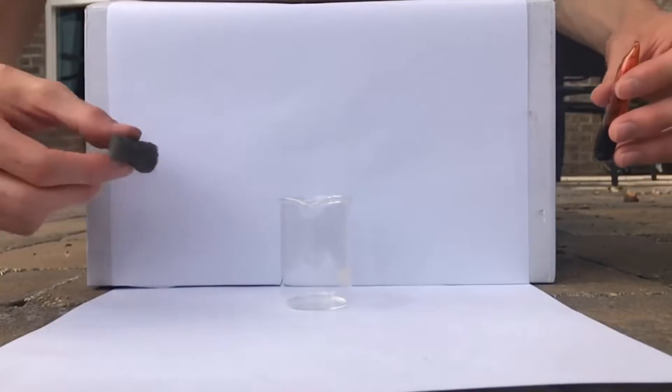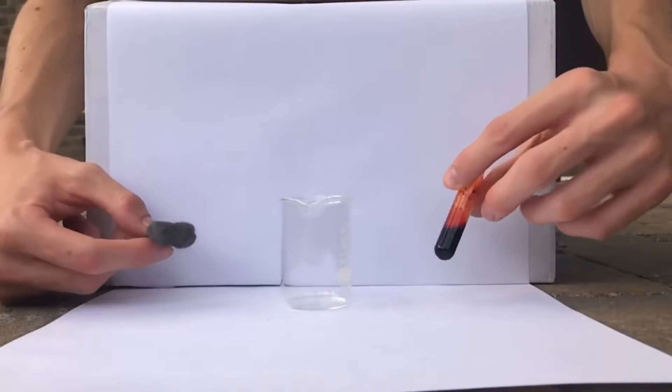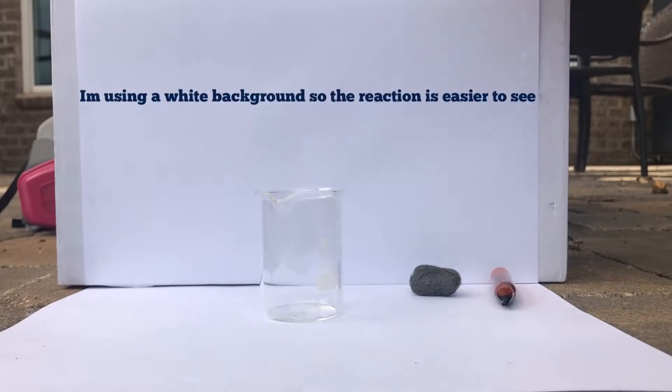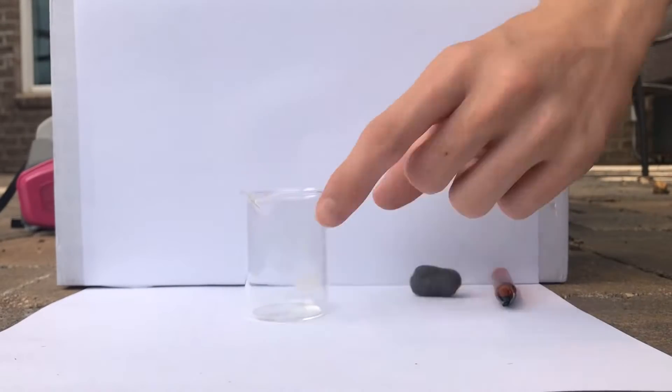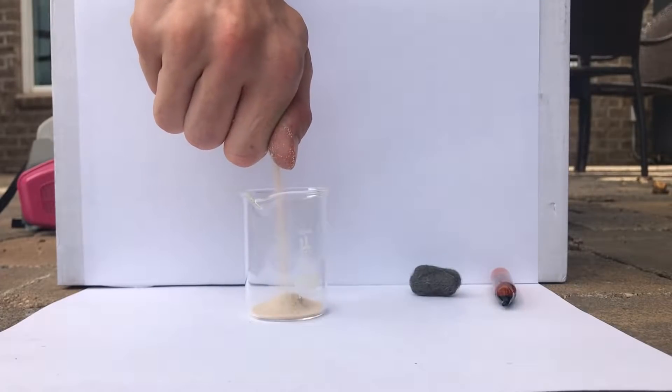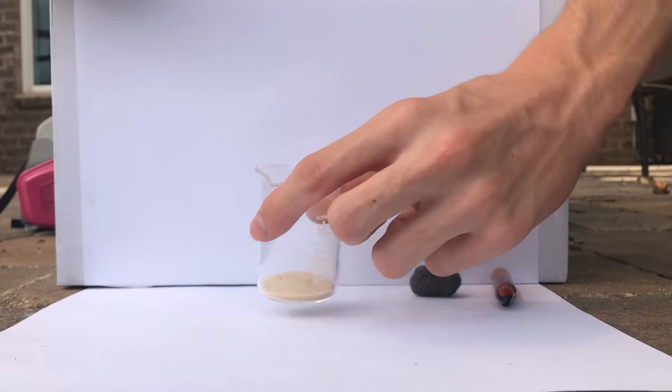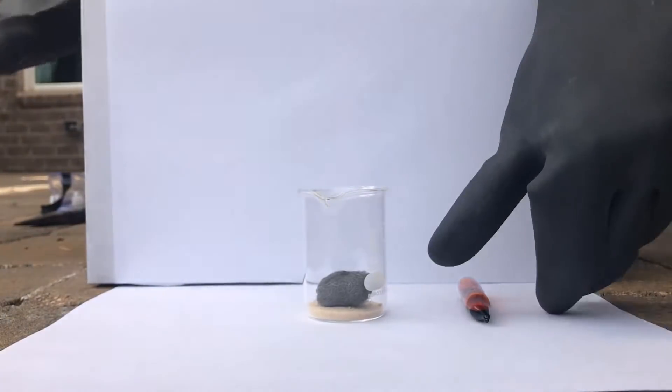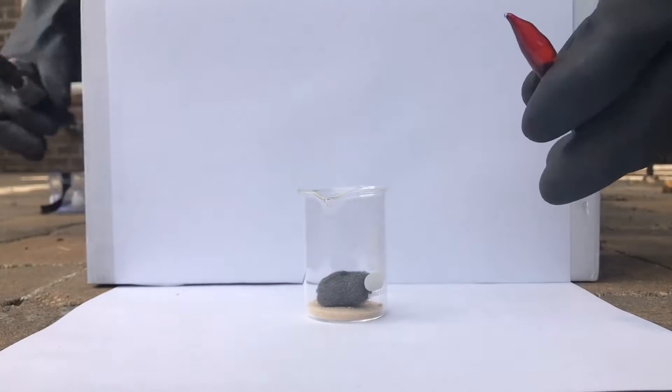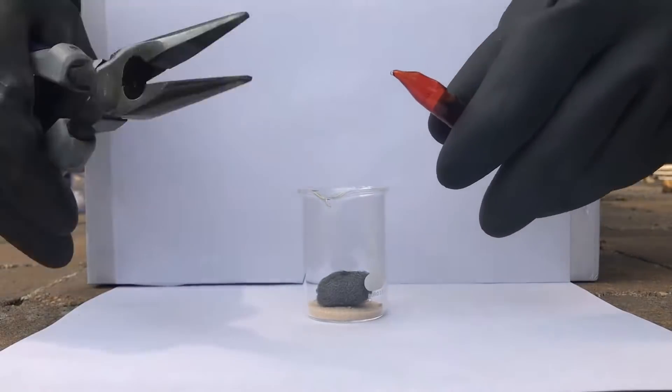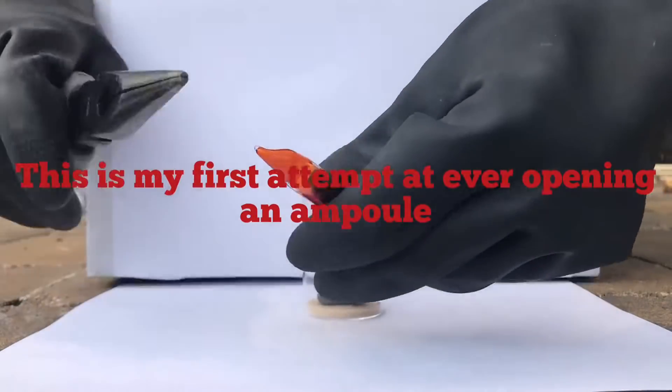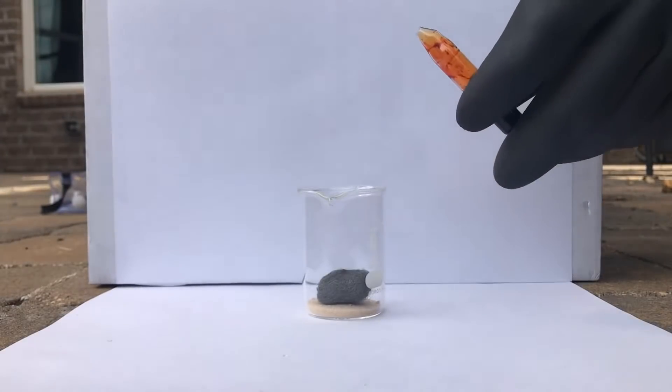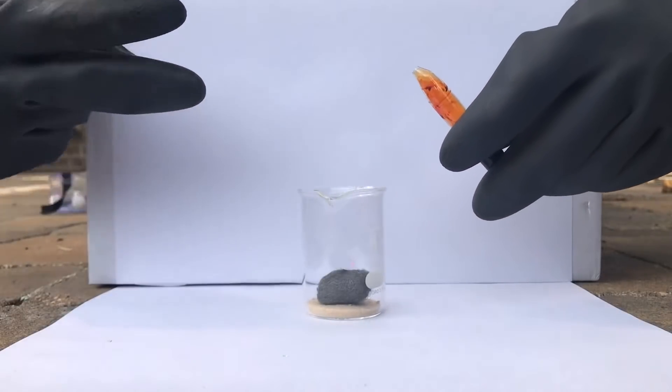Our first reaction is going to be steel wool with liquid bromine. So in order to make sure that the beaker doesn't crack at the bottom, I'm going to put in some play sand. Alright, there we go. So first we're going to put in the steel wool, and then we'll open up our bromine. Ready? Three, two, one.